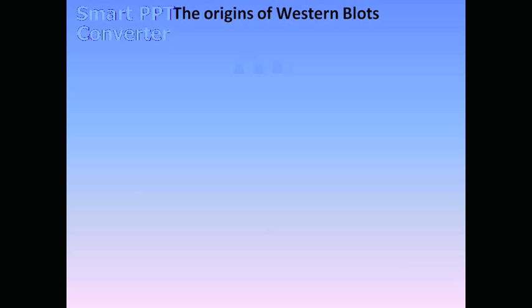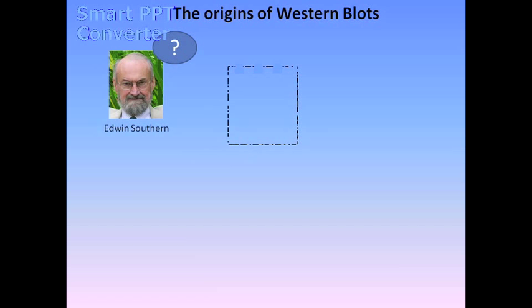In the early 1970s, the possibility of mapping whole genomes arose due to the prior discovery of bacterial enzymes that cut DNA at specific restriction sites and the development of recombinant DNA technologies and gene cloning. Nevertheless, one could not identify one single gene amongst thousands of fragments of DNA until Edwin Southern introduced his eponymous powerful DNA transfer and probing technique in 1975.